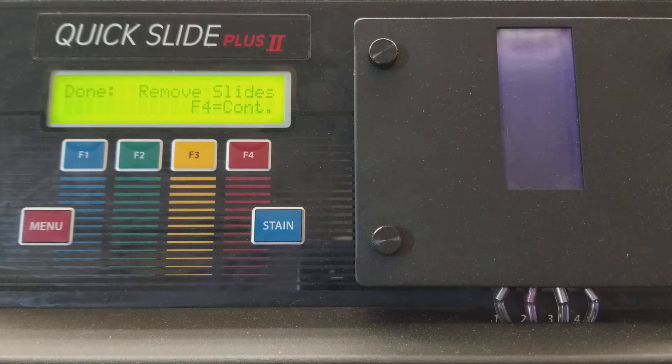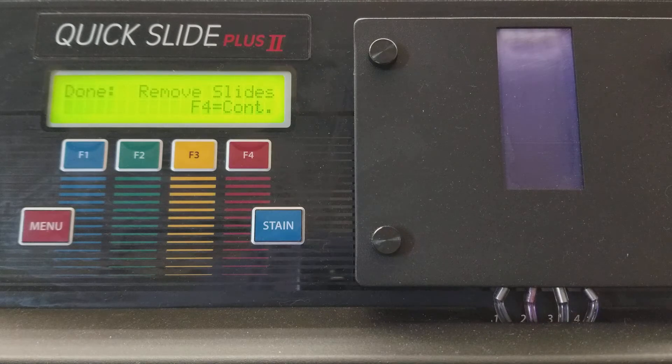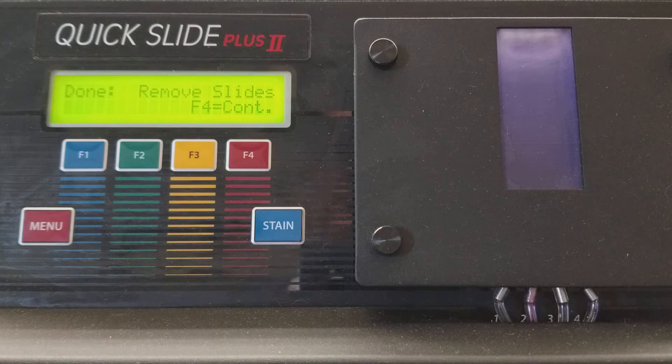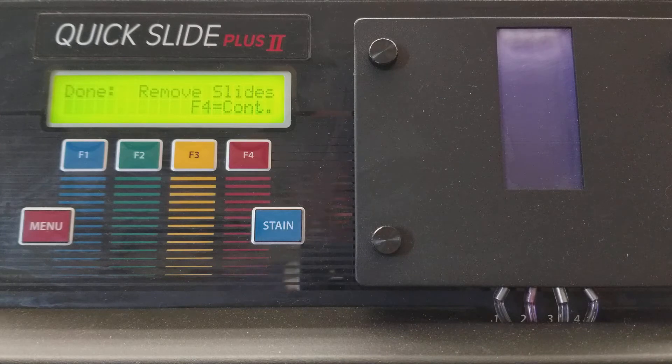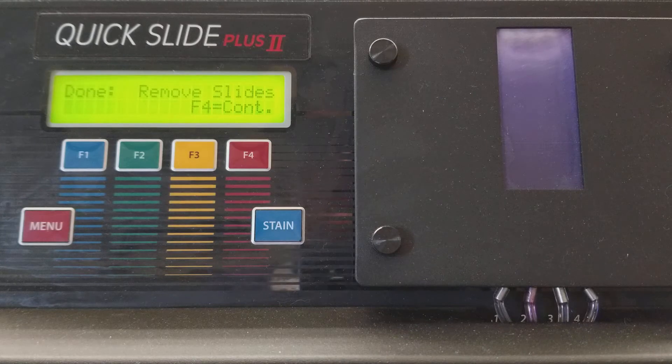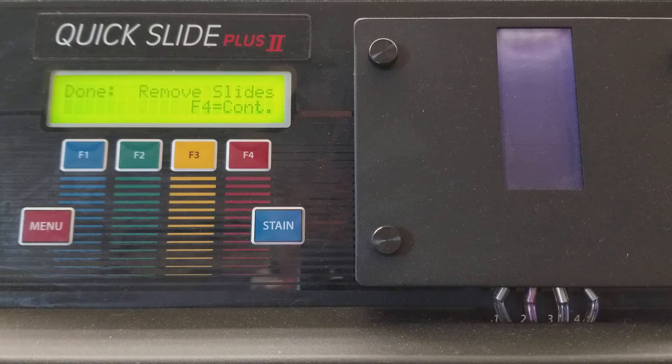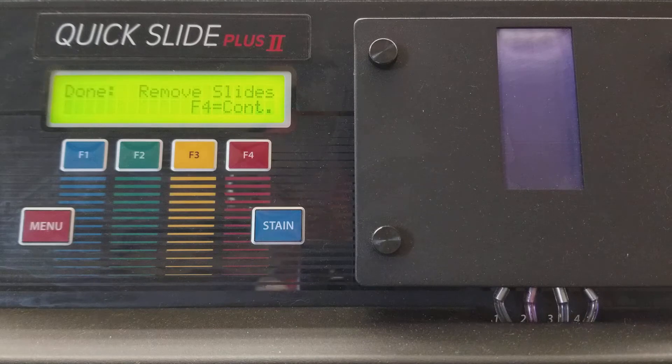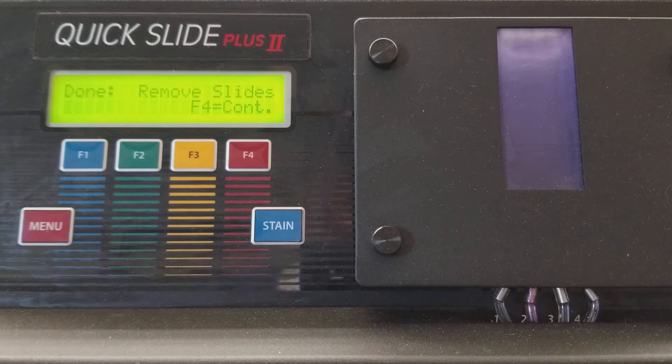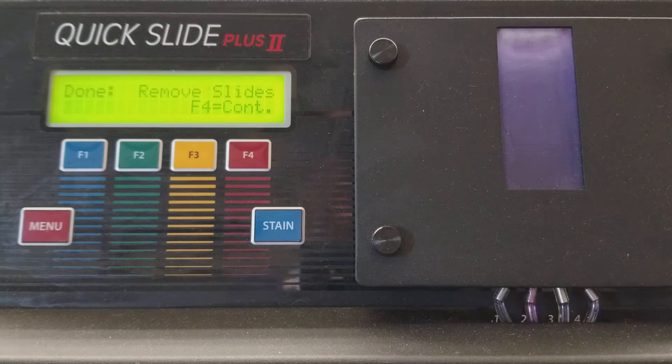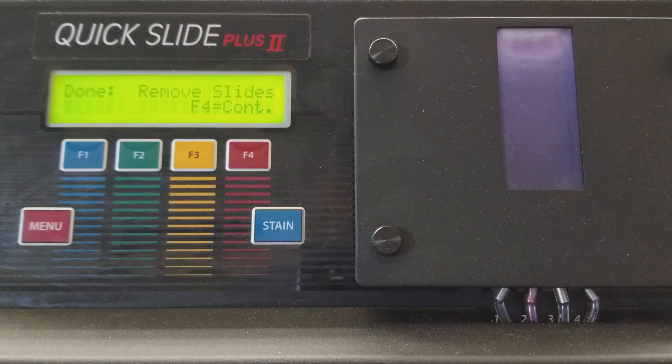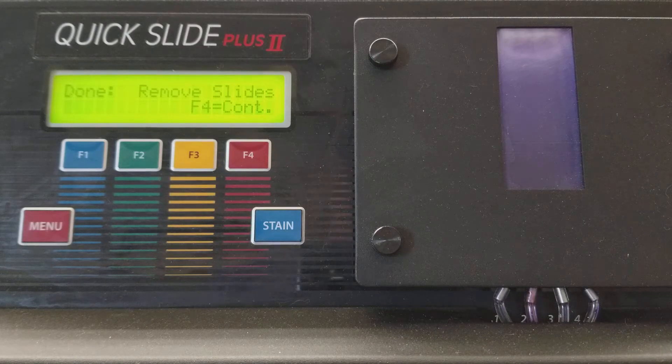Today we are working with the Kwik Slide 2 Plus. It is an automated hematology slide stainer. It can stain both blood smears and bone marrow smears. It does one slide at a time, so this is not for high volume laboratories.